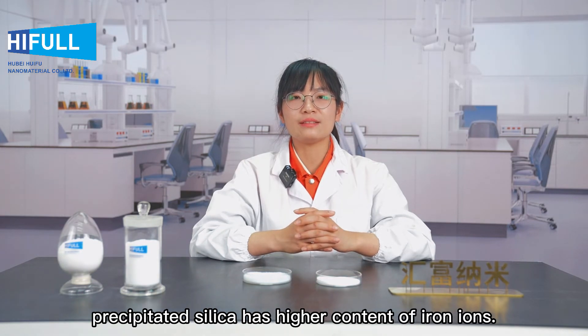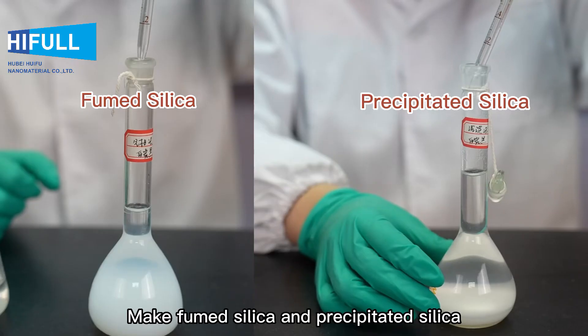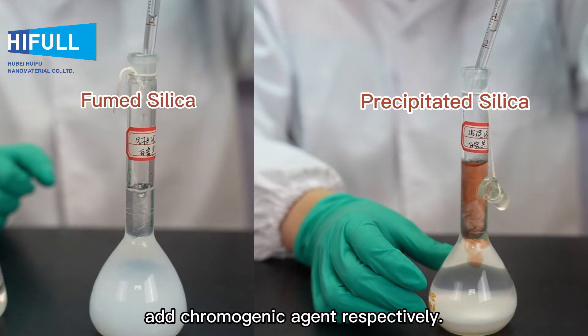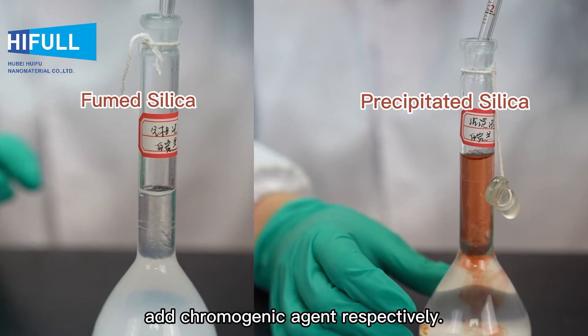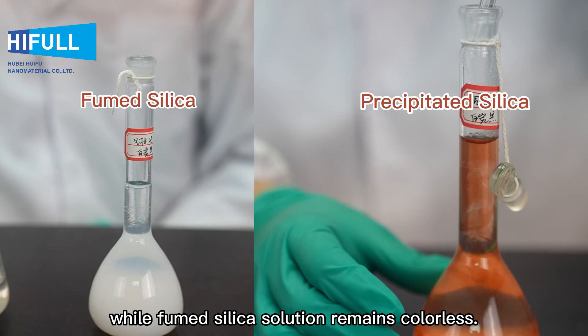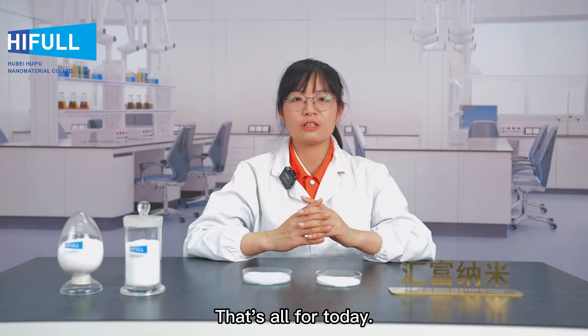Second: determination of iron ions. Due to differences in raw materials and manufacturing process, precipitated silica has a higher content of iron ions. Make fumed silica and precipitated silica into standard solutions and add a chromogenic agent respectively. The precipitated silica solution turns red, while the fumed silica solution remains colorless.